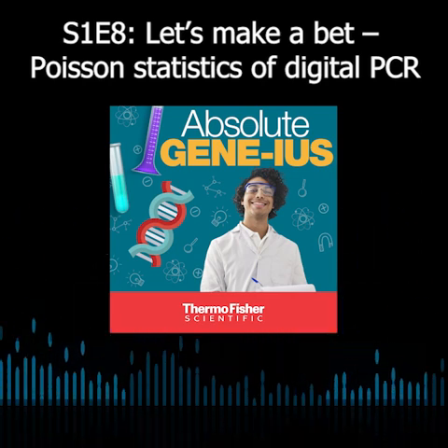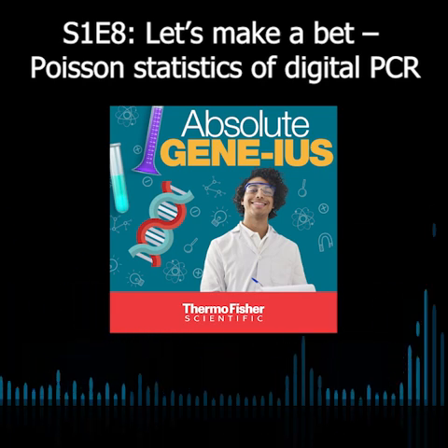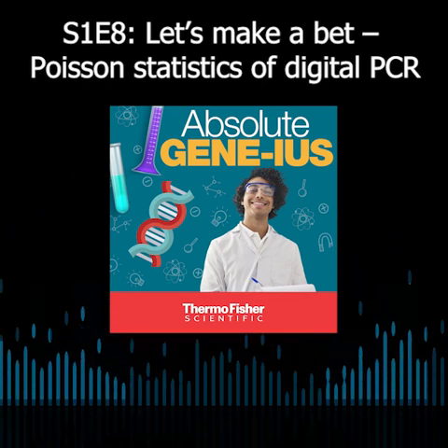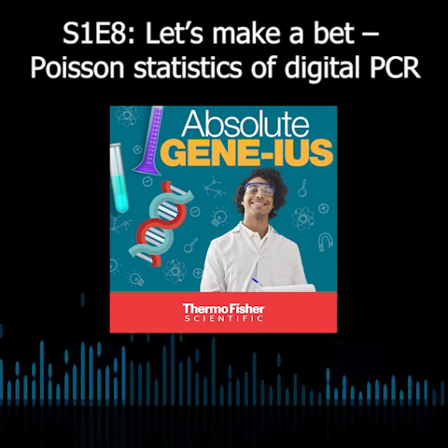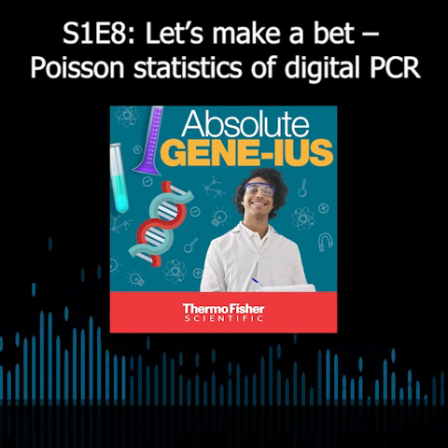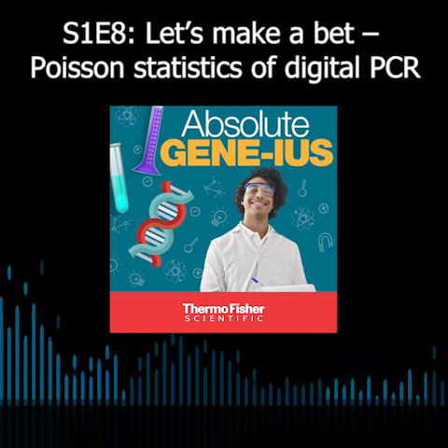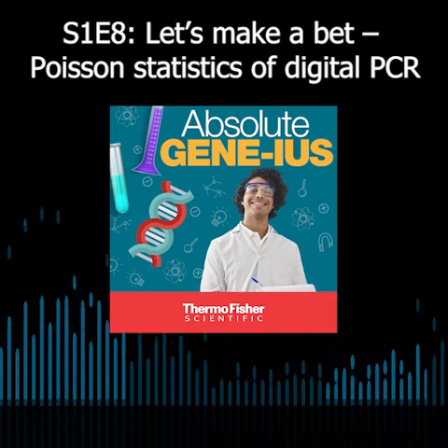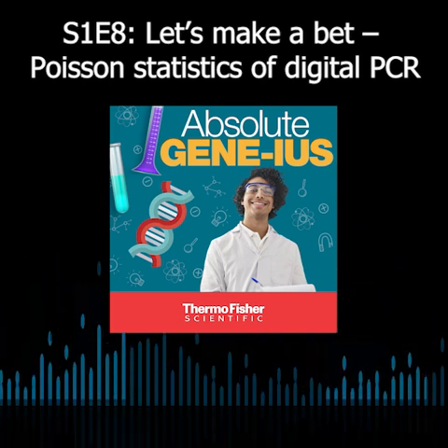Yeah, the idea that you need some of the chambers to be negative is critical. So with digital PCR, if I had such a high concentration that all 20,000 chambers were showing brightness because they all had target in them, I don't really know anything about that concentration. I might be able to say that it's at least 100,000 copies per microliter or something, but I have no idea if it's 100,000 or 100 million. You have no information.